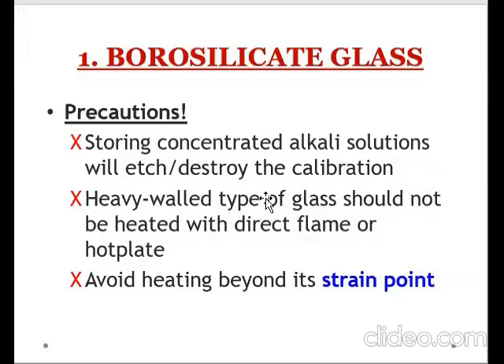So, para maiwasan po yun siya, kaya po yung mga masyadong makakapal na type of borosilicate glass should not be heated with direct flame or hot plate. Okay? Pero kung hindi naman siya makapal, pwede na siya gamitin or gamitan with direct flame or hot plate. And third one, the third precaution, you need to avoid heating beyond its strain point.